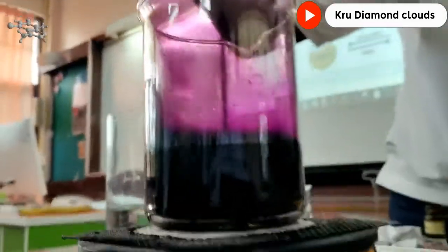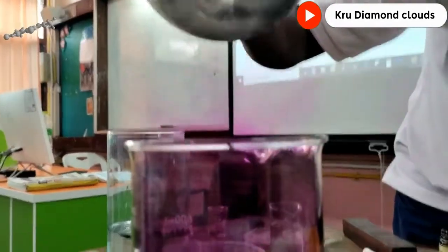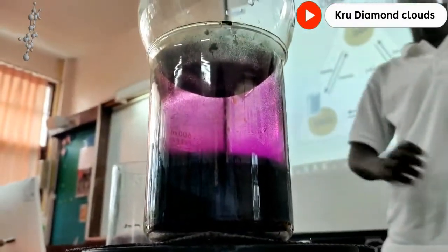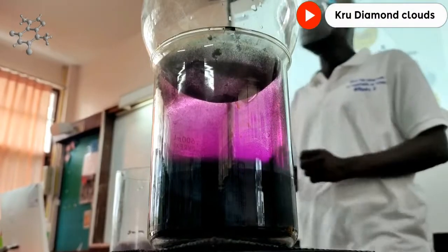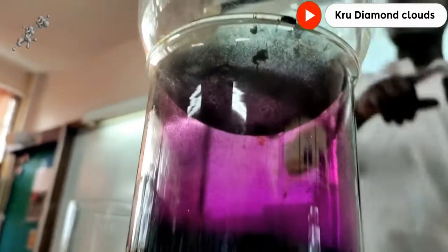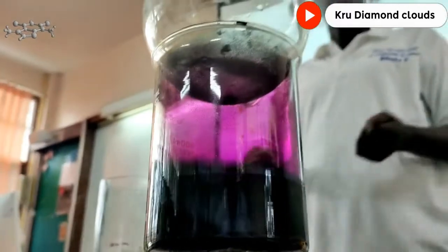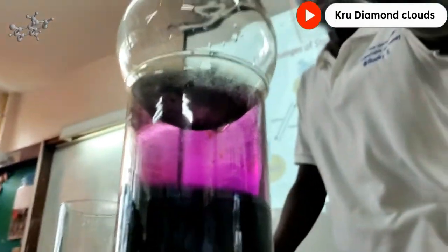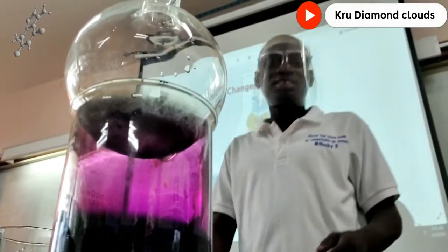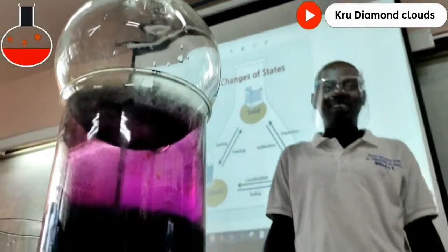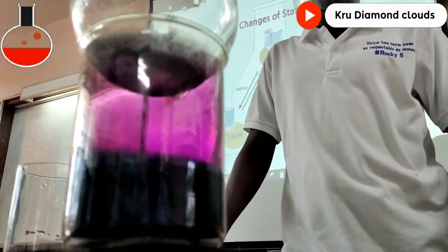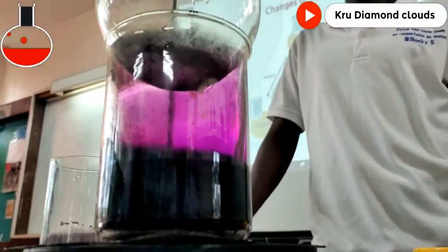You see some crystals here? Yeah, and that is solid. So it's making the crystals at the bottom. So we've done two things — we've changed solid to gas, and gas to solid. That's amazing. It's not magic, it's just science. So you can tell someone: I can make a crystal. You can make a crystal by doing this.